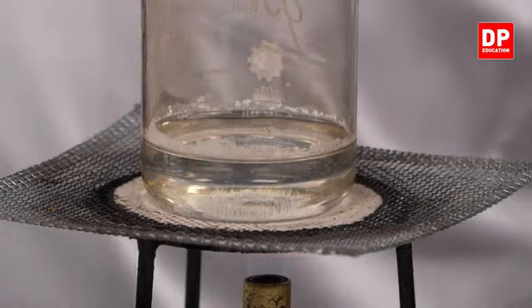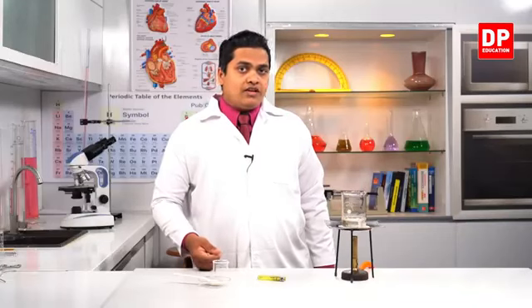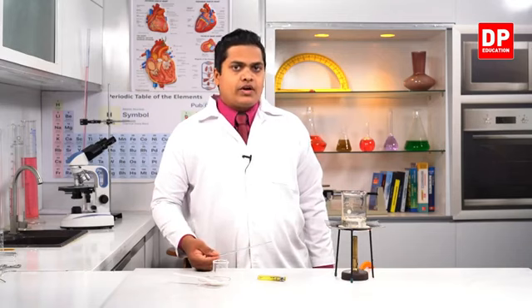So let's give it somewhat more time so that the water will evaporate completely, and we'll observe what will happen at the end of the experiment. Right? So we'll give it somewhat more time to evaporate the water.